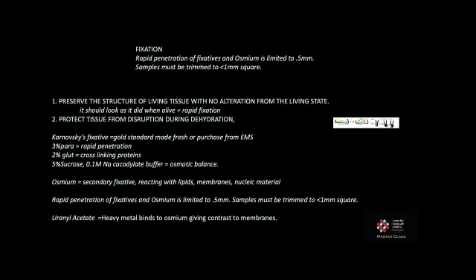So to go into this a little bit more detailed about why we're doing this, what's important, and how we've developed the methodologies that we have. With fixation, we want to be aware that biological material changes very rapidly when it is not in its warm, safe, humid environment. So cultured cells can change their ultrastructure very, very quickly when you take them out of the incubator. So your fixation needs to be extremely rapid.